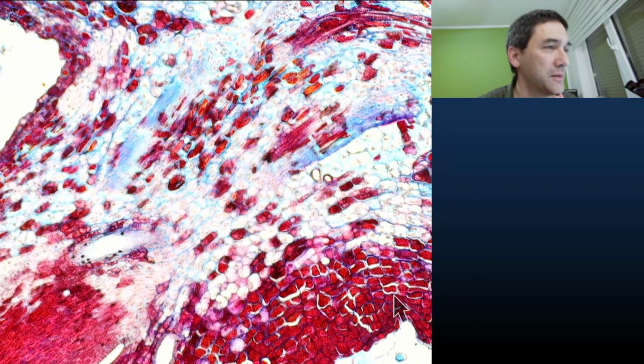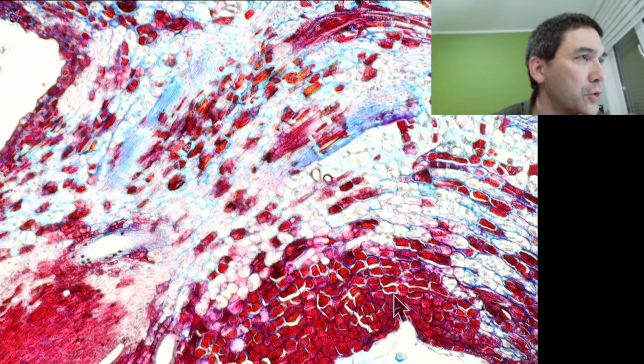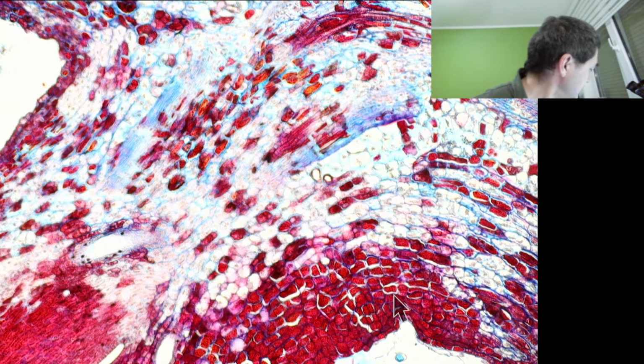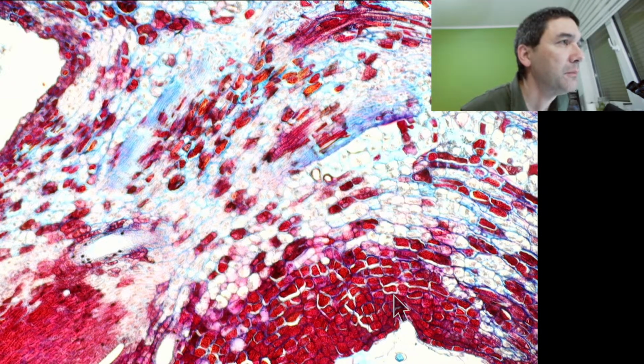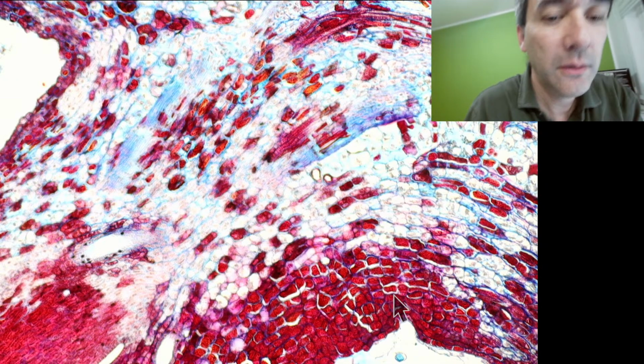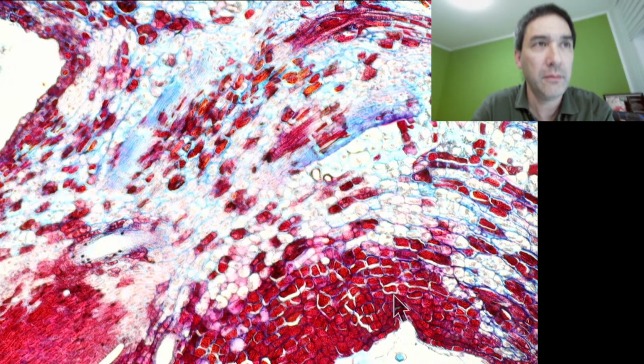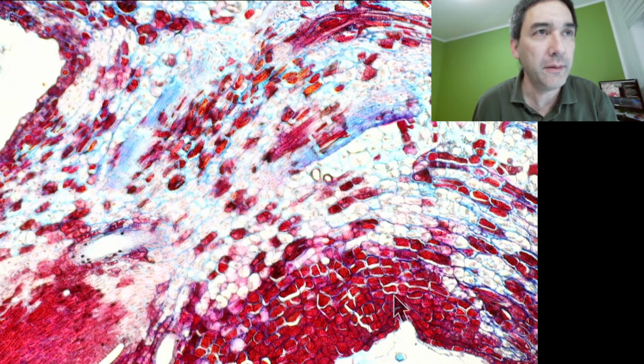I guess this is going to be the emergency solution for right now. Look what I'm trying to do now. I'm going to try to maybe remove this here. I can try to then use this here, and maybe I'm able to make this a bit larger. Can I do that? It's not ideal what I'm doing right now, but maybe I can move this a bit over. But I think it's better like this than nothing at all. I hope that's going to be fine.